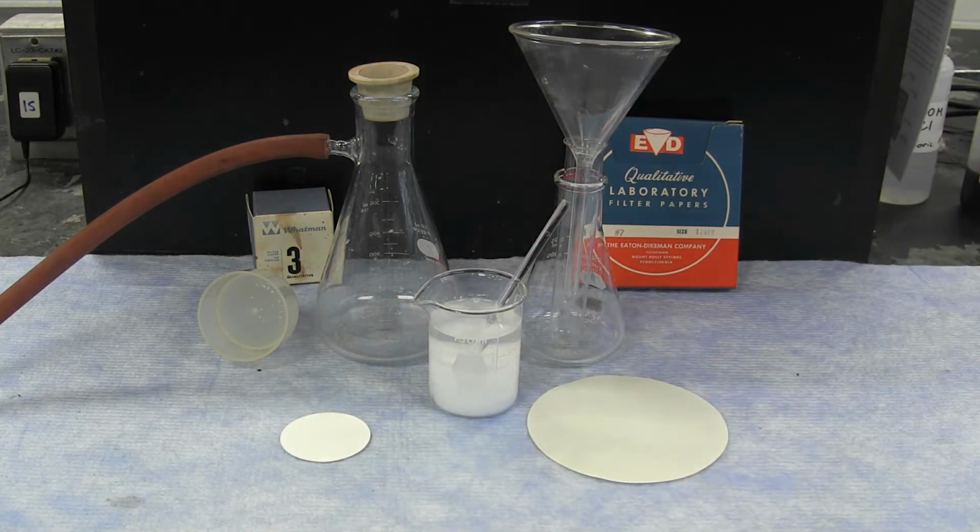The difference between the sheets and how fast the filtrate can pass through it depends on the pore size and the packing of the filter paper itself. How tightly woven are the individual fibers and how thick is it?